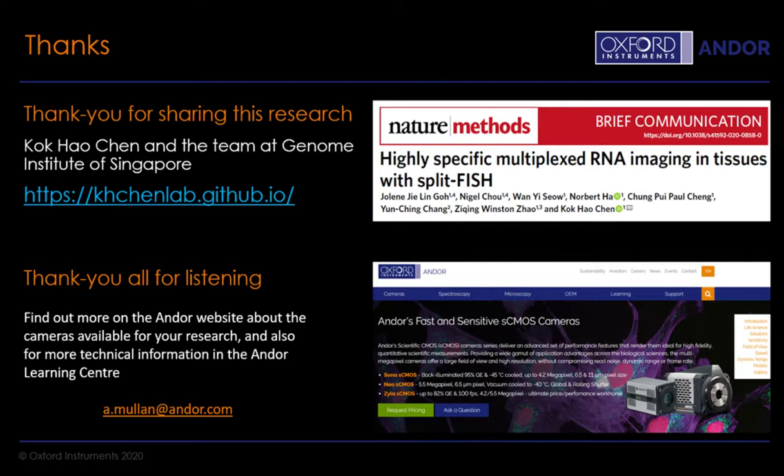The autofluorescence that comes along with the tissue will still show up in our images because we only so far focus on imaging in the red or the far red channel. The autofluorescence is relatively low, but if you use tissue clearing, for example, you can further reduce the autofluorescence of the tissue, especially in the blue channels, and allow us to do imaging there. So adding tissue clearing can definitely improve the quality of the assay.